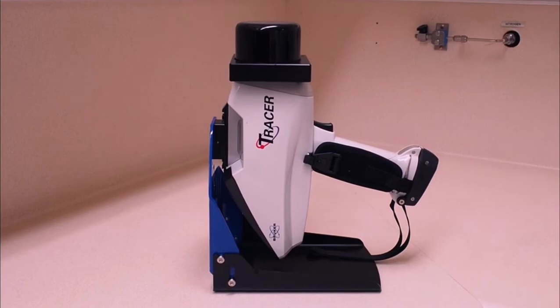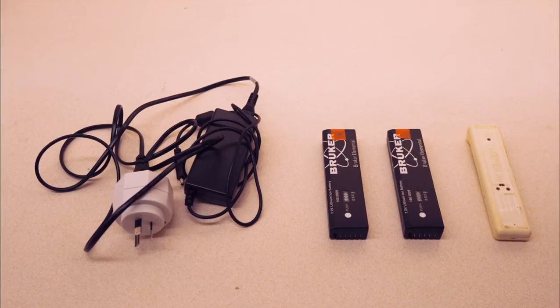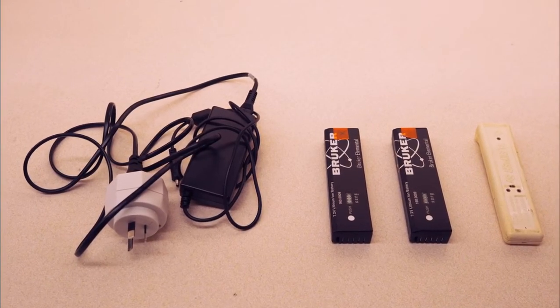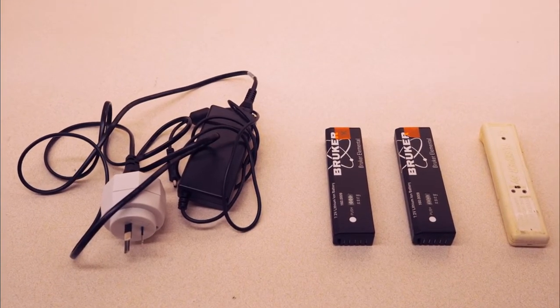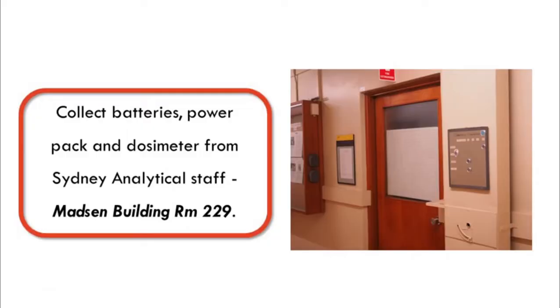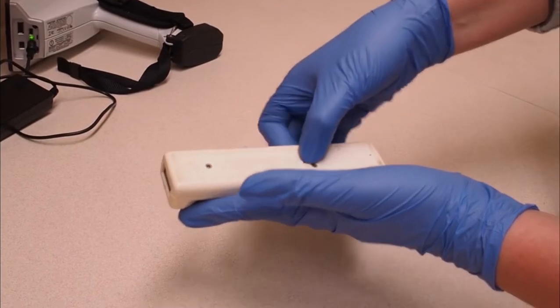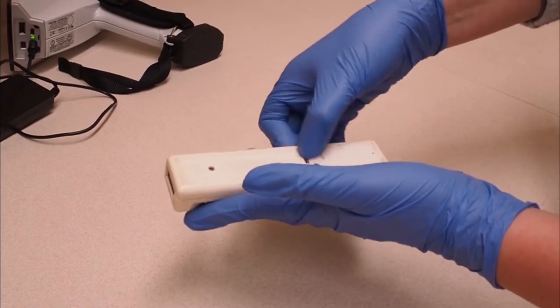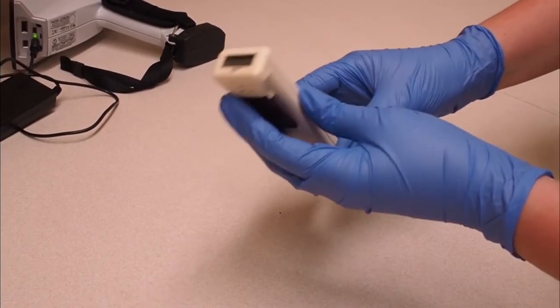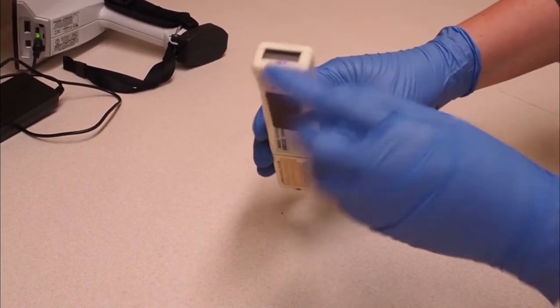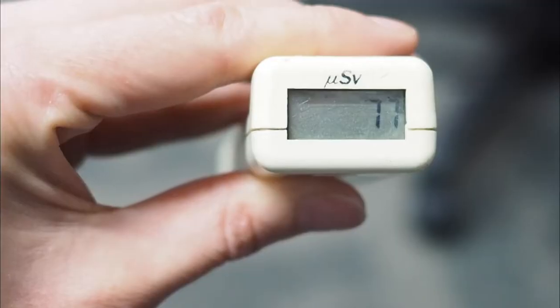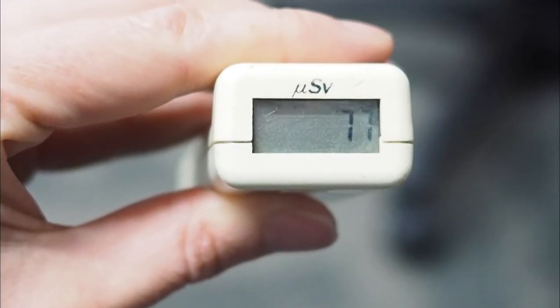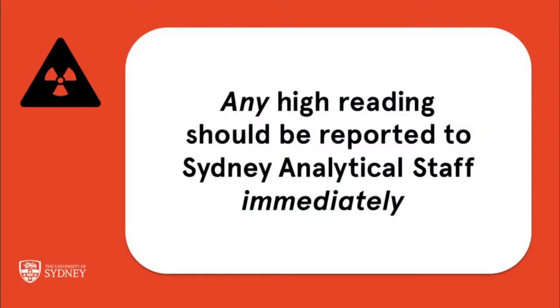For security, the batteries and power pack are kept separate to the instrument. You need to collect these along with the user dosimeter from Sydney analytical staff whenever you are using the tracer. Keep the dosimeter on you at all times while using the instrument. Inform staff of the final reading once you have finished your booking. Should any high reading be recorded at any point during use, inform staff immediately.